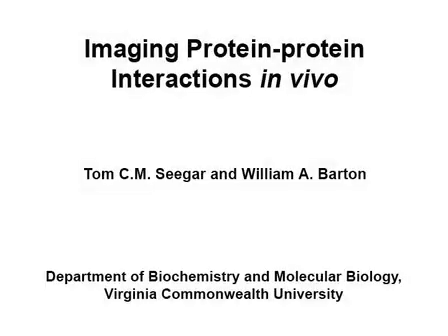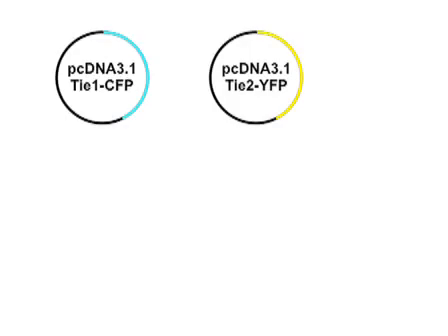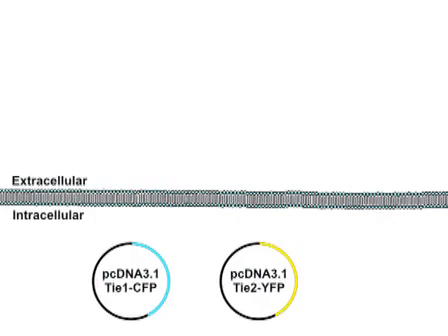The overall goal of the following experiment is to evaluate the presence of protein-protein interactions on the cell surface. This is achieved by cloning two receptors of interest amino terminal to two fluorophores that have overlapping emission and excitation spectra. As a second step, the two vectors are simultaneously transfected into endothelial cells for receptor expression.